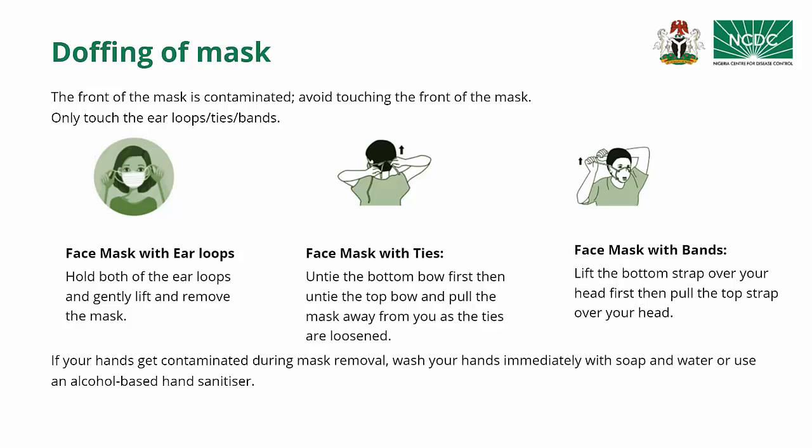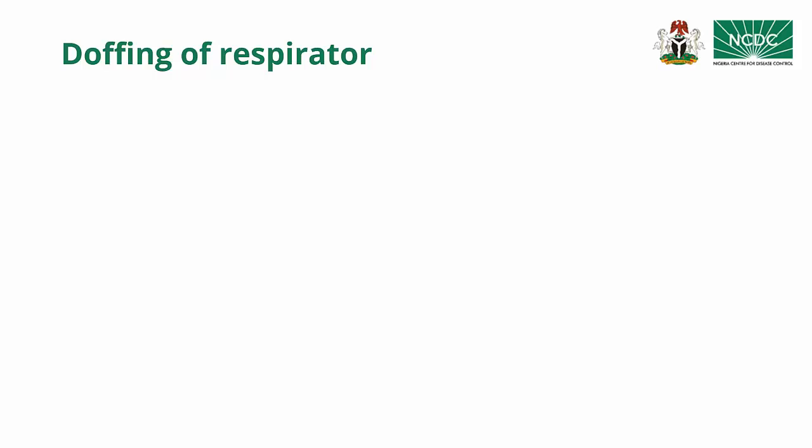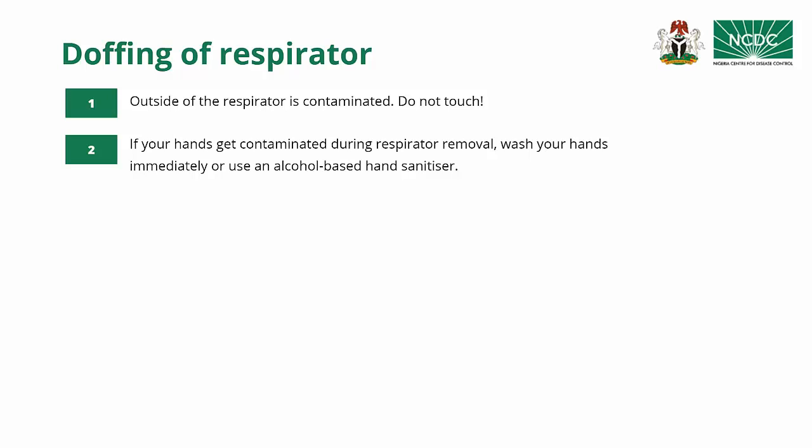To doff respirator. First, note that the outside of the respirator is contaminated. Please do not touch it. But if your hands get contaminated during respirator removal, wash your hands immediately with soap and water or use an alcohol-based hand sanitizer.